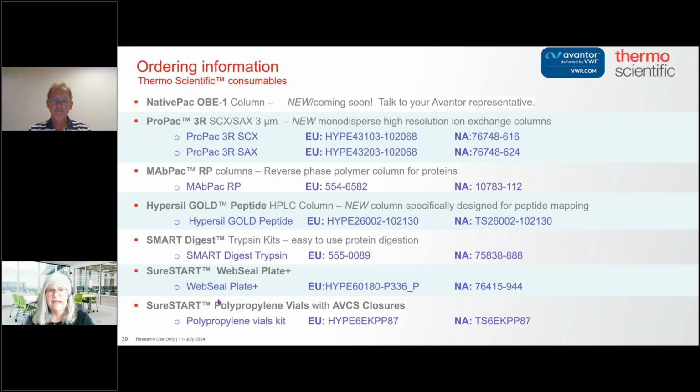Thanks a lot. And the next question is coming from the US. Do you have a problem with deamidation using the Smart Digest protocol at 70 degrees? Now that is a good question because I forgot to mention it in the talk. What we're looking at is deamidation. Yes, the temperature's up high, and yes, deamidation will occur more rapidly at a higher temperature. But we're not running it at pH 8, and deamidation occurs at high pH.